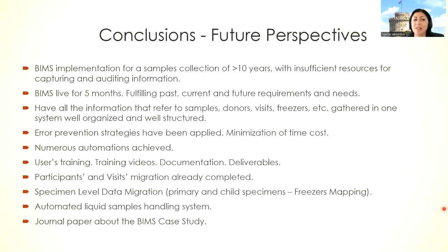Despite all the difficulties, the system is currently live for the past 5 months, serving the biobank's demands and being able to accomplish its goals of effectively performing data management and auditing every action in the system. And all these by minimizing at the same time the time costs and by preventing human errors. I believe that the transition from the old to the new biobank information management system was smooth due to the exhaustive testing and training procedures that were followed. The BIMS was also one of the biobank project's deliverables.